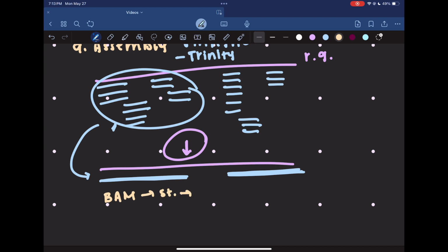Then I got a GTF file as output, and we can take a more thorough look at some of these file types in another video. It's just another way of representing the sequences and where they align on the genome. So I would input my BAM file and get a GTF file out for each tissue. For each tissue, I repeated this process and generated, for me, 7 separate GTF files.